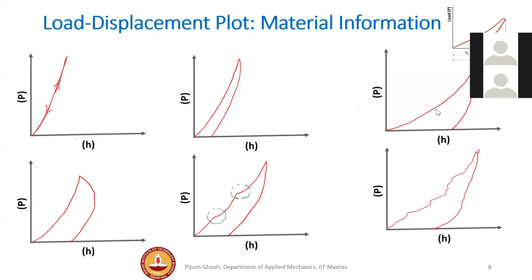One of the most important things is, as one of your friends asked, the roughness. So you have to have a smooth surface as much as possible. But otherwise, there is not very much difficulty as far as sample preparation is concerned, because I have given you the dimensions. You can use even a centimeter length scale sample with millimeter thickness, which is not difficult. The only thing is that if you are working on a crystal and you want to do phase identification or phase indexing, you have to be very careful during the growth of the crystal to make sure you know which phase it is, which is X, which is Y, which is Z. And then accordingly, we bring it in here and do the indentation. That is very important when you are working with a crystal. But otherwise, in general, I do not think sample preparation for indentation is that big a challenge. We have not faced that much.